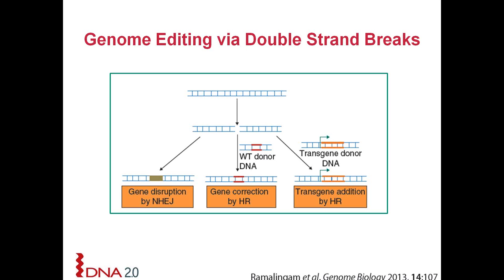If it's a sequence that you have sequenced and you'd like to keep it private, we can do that too under some circumstances with the right arrangements in place. If it's just a GenBank file that you want to be made available through the tool and that you can use, we're happy to entertain those as well. What we have now is a running list of genomes. We are working on getting those up on our system. There's no barrier to doing that. It's simply just letting us know which ones are of interest to you.